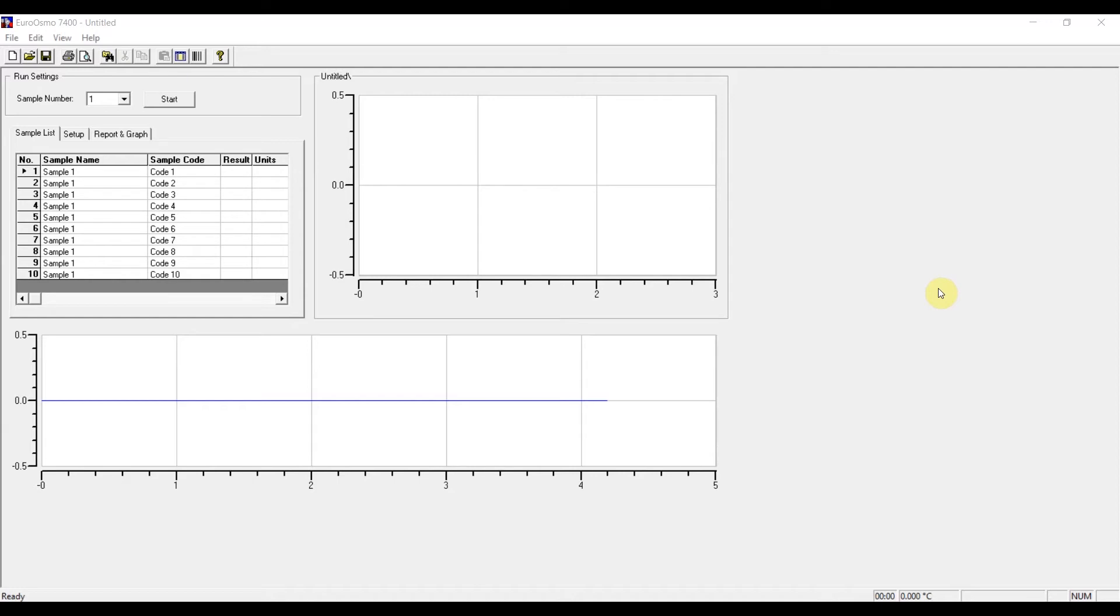The user interface, as you can see, looks like this. And it covers the basic functionalities of the operation of the osmometer.